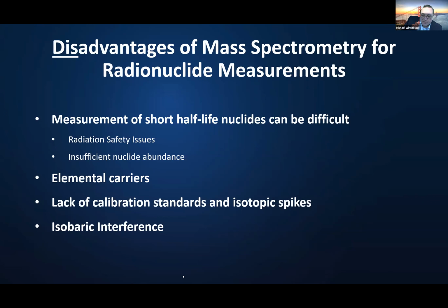Okay, so back to the spectrometric solutions. This is a good opportunity to make one point about those, the SRM 3100 series. We see this happen a lot. Those are produced in the group that I lead here at NIST. And we see those used as isotopic standards a lot because there isn't anything else. And folks take a particular SRM in the 3100 series, measure the isotopes, and then they use it that way. And this is the point I want to make.